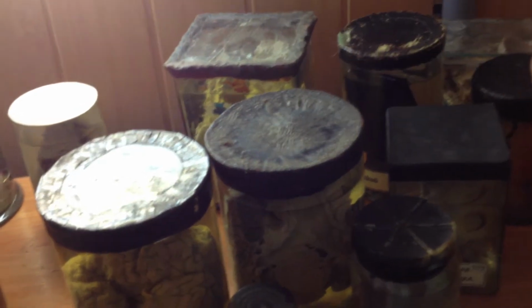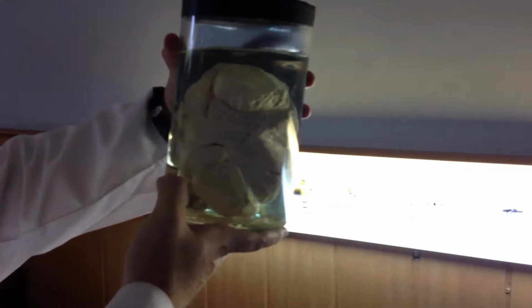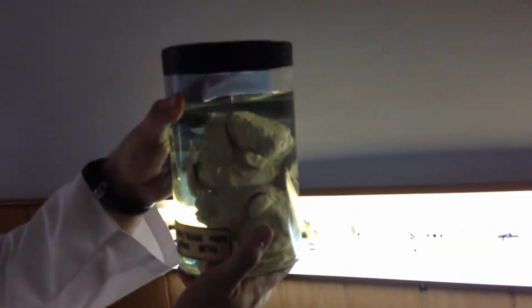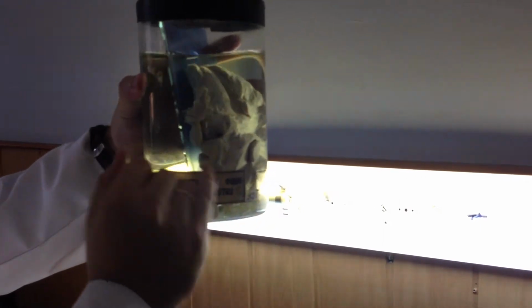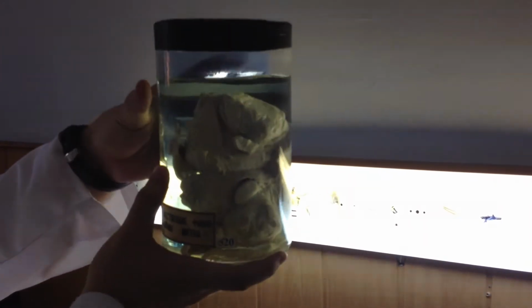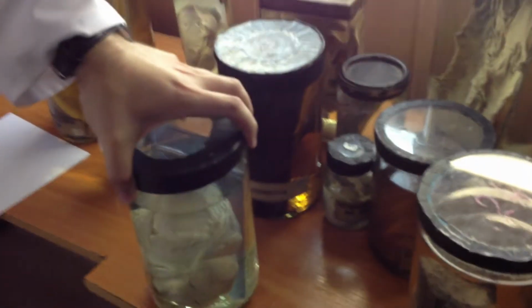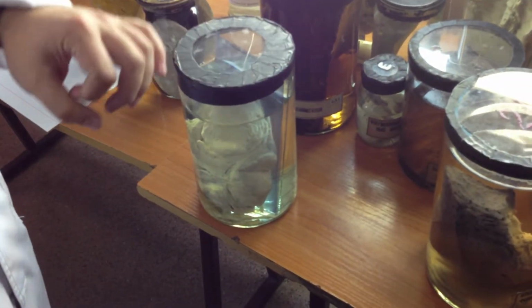What about this one, teacher? This is the uterus with multiple fibromyomas. So this is a benign tumor of the uterus. Uterus with fibromyoma. This is a mixed tumor consisting of both fibrotic tissue and muscle tissue.